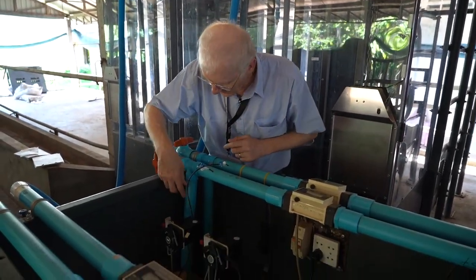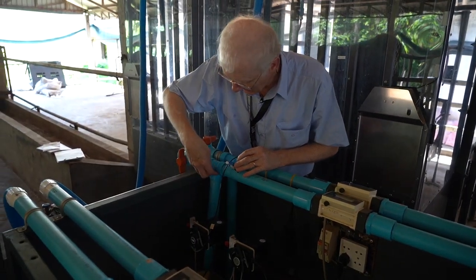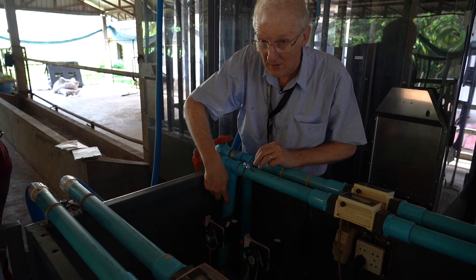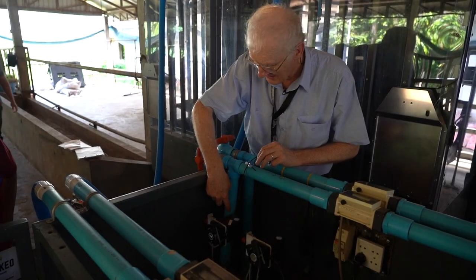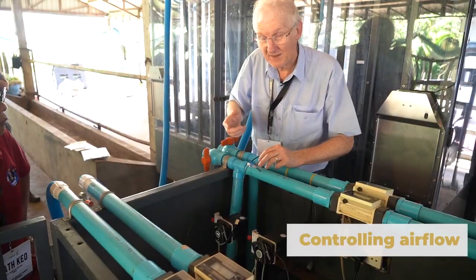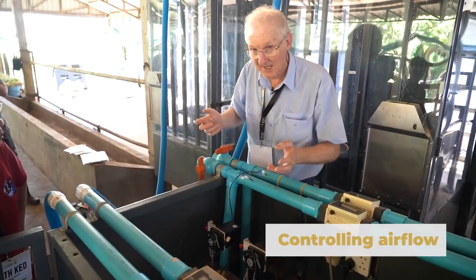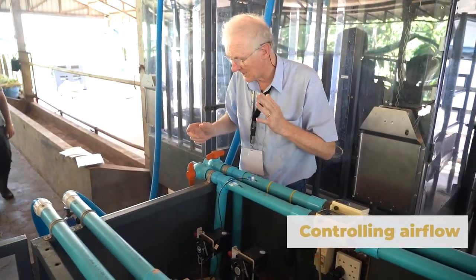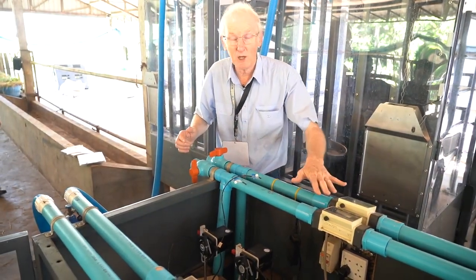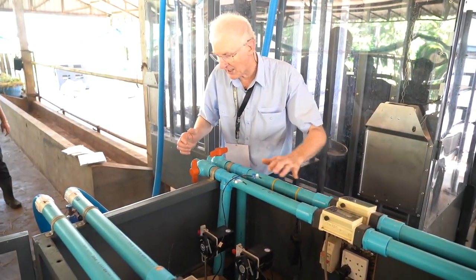But the other thing we have is this junction here. We can use this one as the example. Here the air is coming along from the chamber and getting drawn down to a pump that we will look at in a minute. But somehow we need to control the airflow to get the flow we want, which in our case is typically 500 litres per minute. And the way we do that is, let's imagine it's pulling 700 litres a minute. We want to lower it.